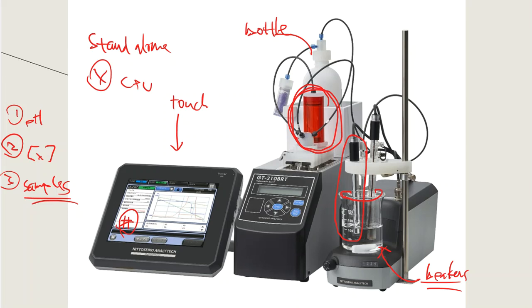and these beakers are going to provide an area for all of the things that need to actually fit inside. So that will include the pH probe, any other temperature probes or any add-ons that you've got, the stir system, and then also the burette tip. So how does the titrant get inside of the beaker? So these are the components that you will often see with any automatic titrator. It's just different models, different manufacturers, different ways that they look.